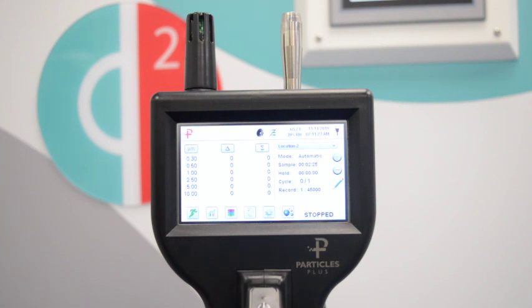Be careful not to stand in between the airflow and the particle counter, as you would obstruct airflow and influence the counts.